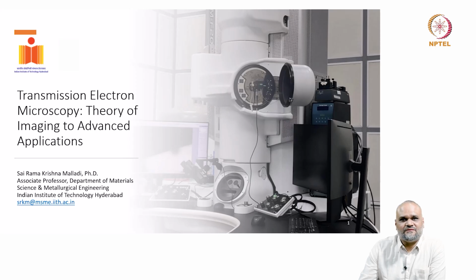And my objective of teaching this particular course, transmission electron microscopy, theory of imaging to advanced applications, is to prepare the audience who are attending this course to be ready to handle the microscope hands-on. The whole objective is to give you a brief introduction of TEM and then take you through demonstration sessions where I'll show you the various operating modes.